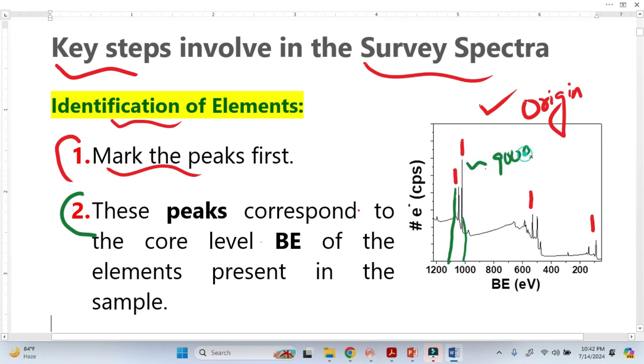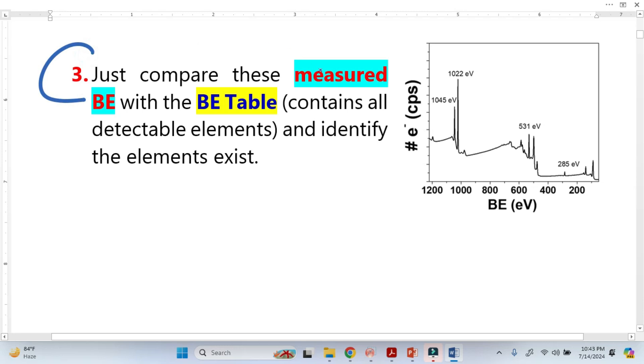Now in the third step, just compare the binding energy in step two with the binding tables. We have the binding tables and it is available online. This binding table contains all elements binding energy except helium and hydrogen. So just compare the binding energy values from step two to this step, the binding energy tables, and just write those values here.